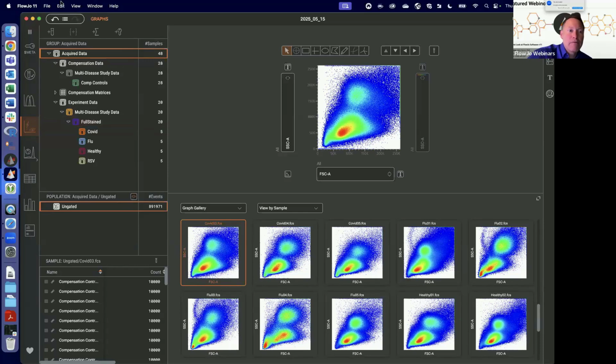You can hit a File Save Workbench to version 10 option right here out of the File menu, so that if you try something in V10 and you're working along and you decide there's a tool that was missing, we're still trying to make an improved version of the cell cycle model, for example, you can essentially bail out to V10 and finish the work there. We haven't worked it out to go forward yet. So for the time being, V11 will be starting new experiments tool, and we will definitely build in the ability to read V10 workspaces. Good question.